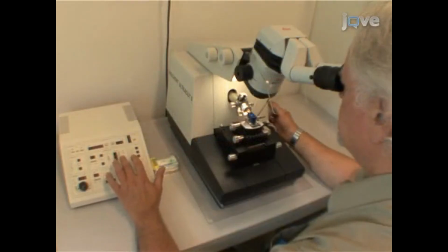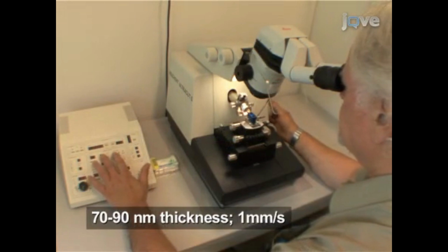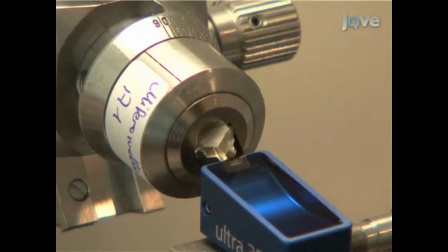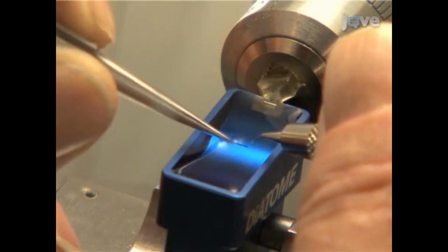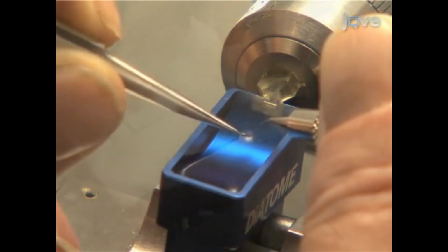Set the ultramicrotome to cut sections of about 70 to 90 nanometers in thickness at a cutting speed of around 1 millimeter per second. Section the block using a diamond knife at a knife angle of 45 degrees. Pick up multiple sections with a formvar-coated copper or nickel 200 square mesh grid.